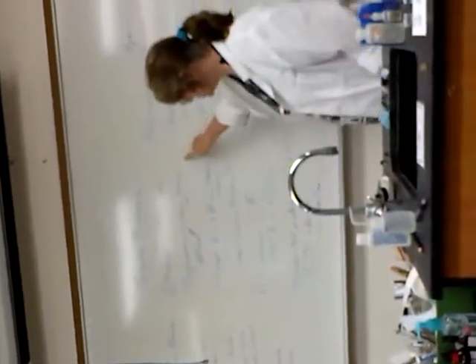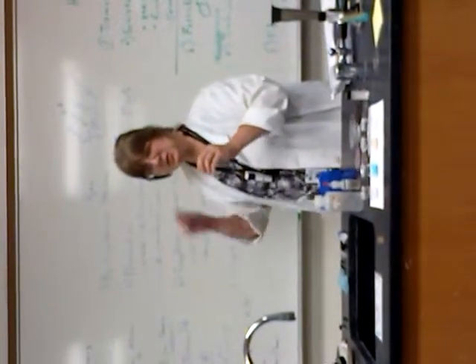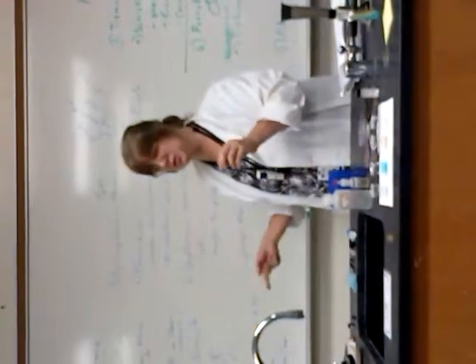First one, Trypanosoma. Looks like a ribbon, but he's between the red blood cells. He's not eating them. He's in between them. And I'm going to scroll through some pictures. Two diseases, Chagas disease and African sleeping sickness. Geographically located, certain vectors associated.